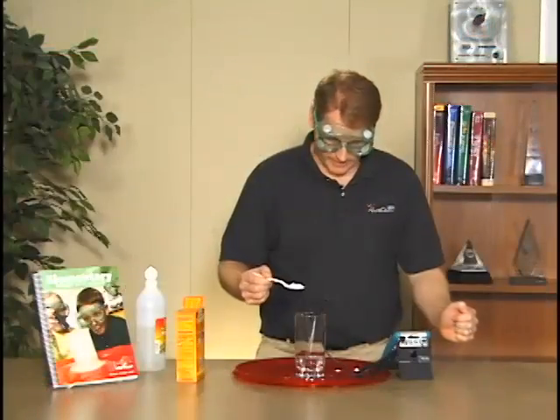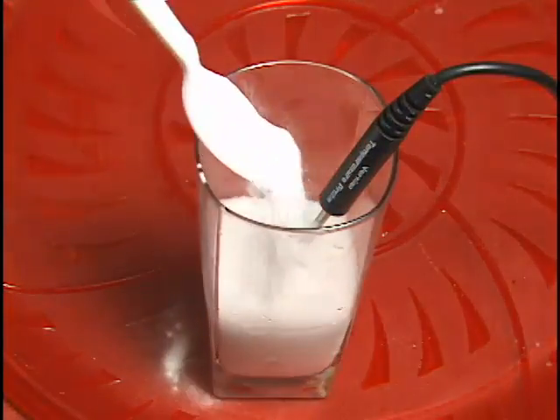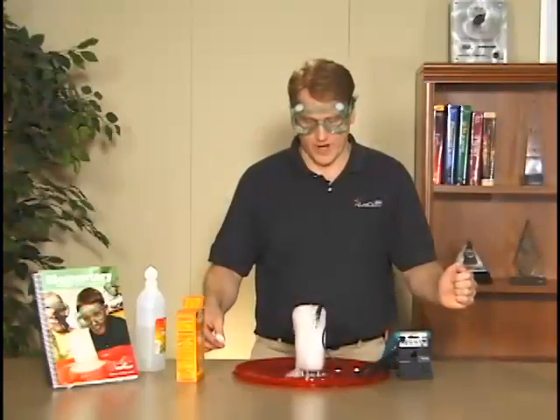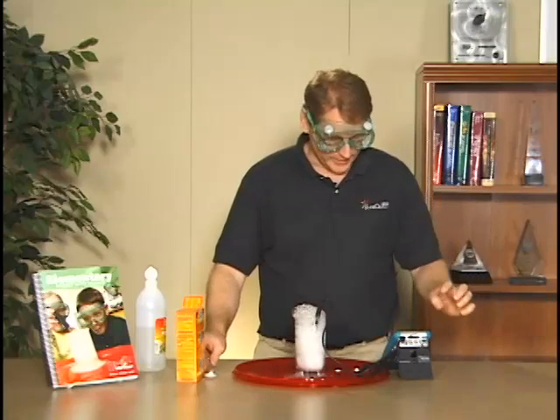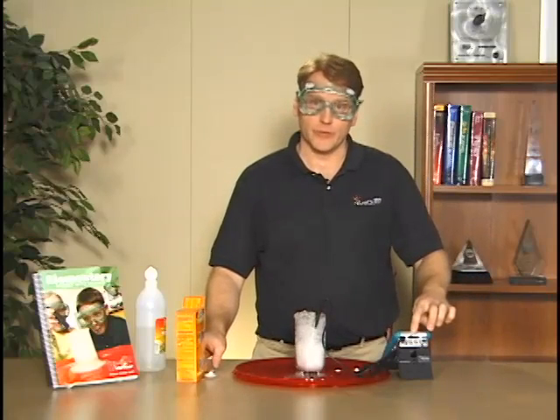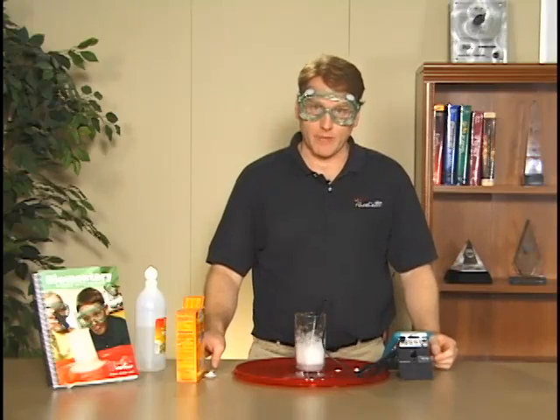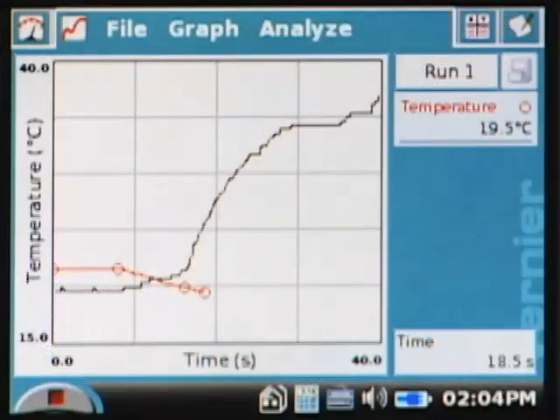You see now why I have the tray. The device is collecting the temperature twice a second and is drawing that graph in real time as it's collecting, so we actually see what happens here.